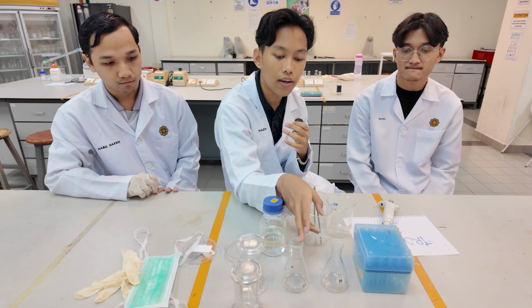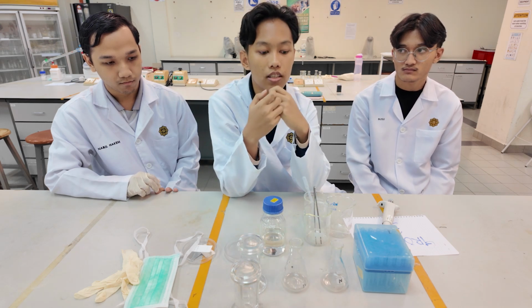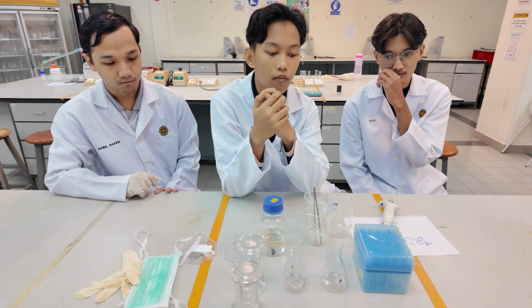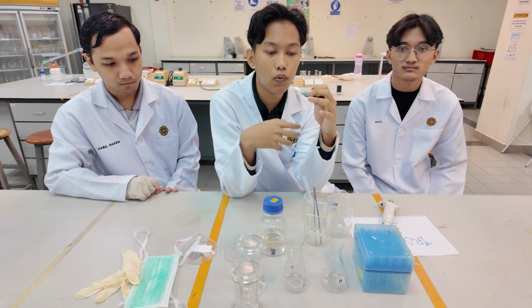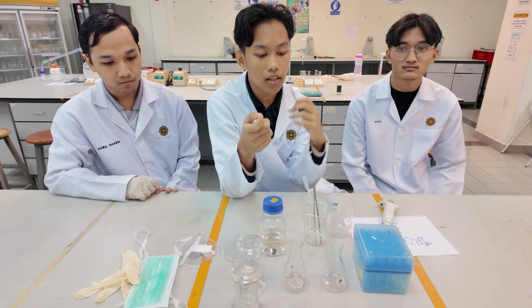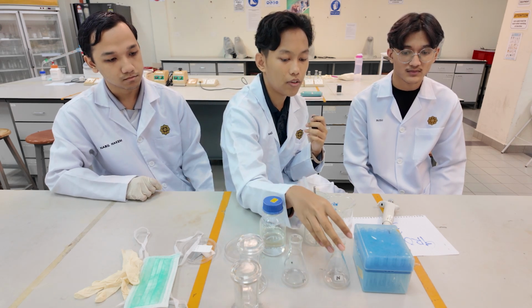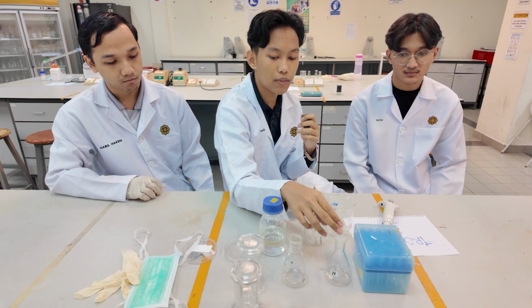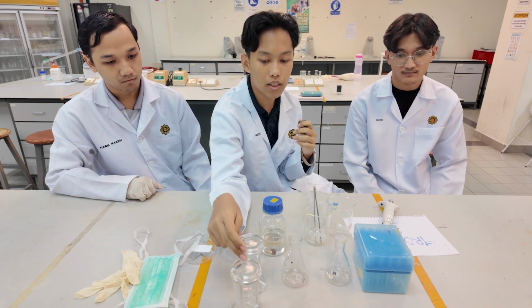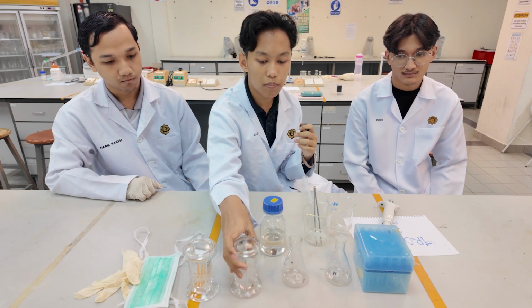Next one, we have ethanol and hexane. How much do we need to put inside each flask? We use a ratio of 9:1, 9 ml and 1 ml, with a total of 10 ml. We mix it very well, and then we take 5 ml of each mixture to the developing chamber. Okay, done for the developing chamber part.